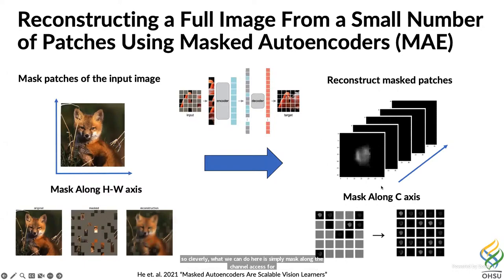So what we feed in as input are the single cell images cropped to a 32 by 32 pixel region, and then they have the 25 channels for each marker stain. And so conveniently, the 25 markers can be reformatted into this 5x5 grid where essentially each patch now is a single image channel, and we can just mask channels the same way that we were masking patches in the original implementation.